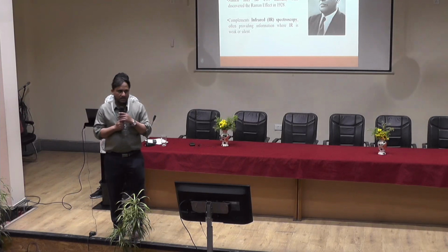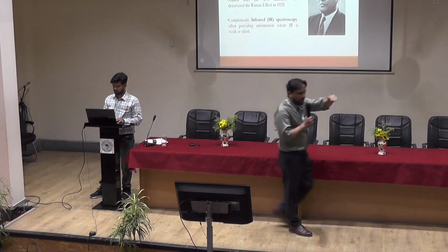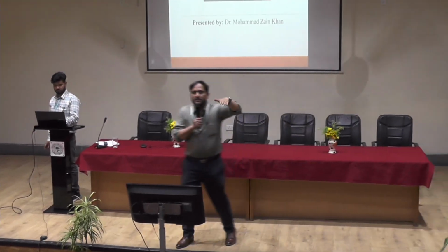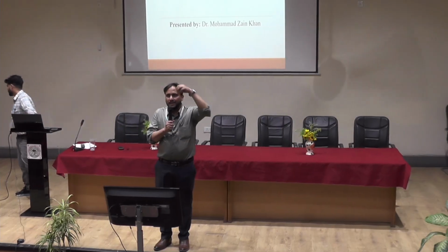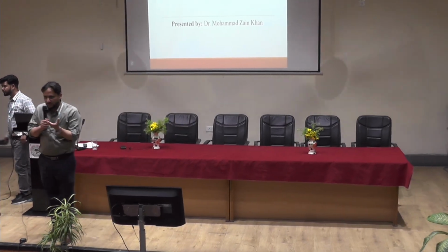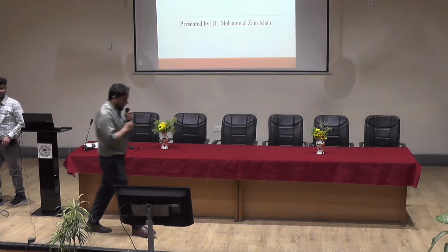X-ray diffraction. Basically, light is diffracted by different planes of a material. A material has different planes present in it. When the light is incident upon it, the light is diffracted. Diffract means turn, due to the sharp edges of the material.